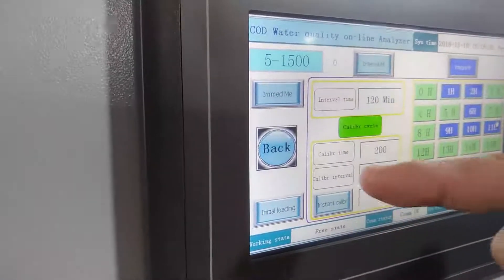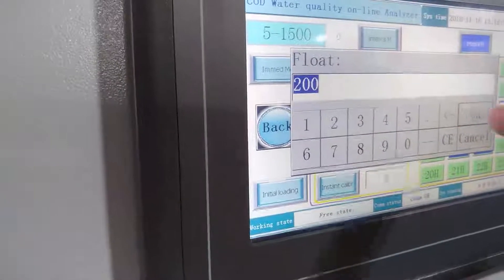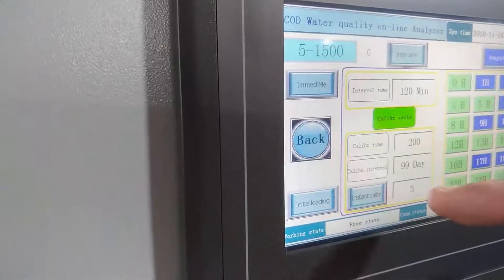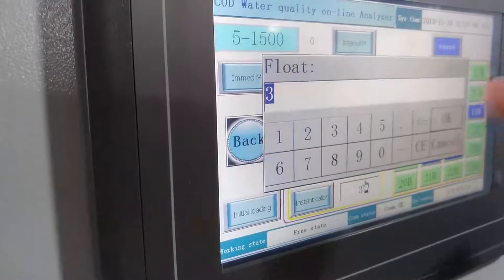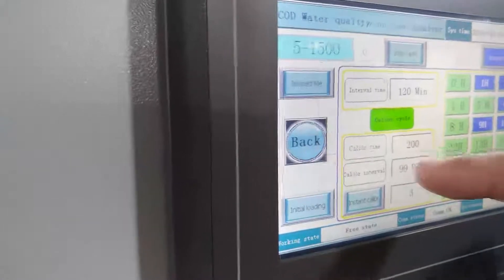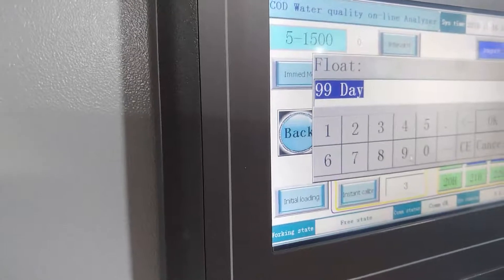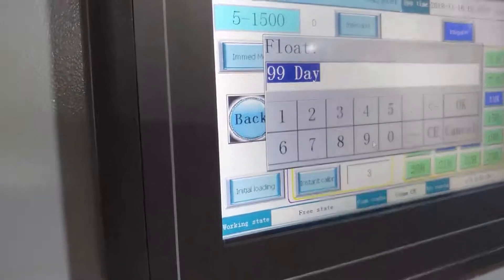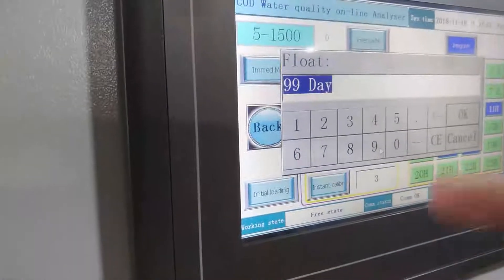For calibration, the calibration time is 200 — this value is fixed, please do not change it. This value is also fixed at three — please also do not change it. This calibration interval is based on your requirement, but we recommend you calibrate at least every 30 days.